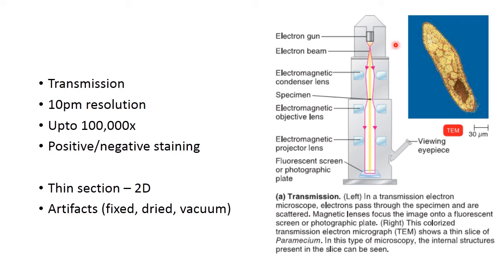So this is how the image would look. The image is actually a black and white image which is later colored using different colors by using image processing software.